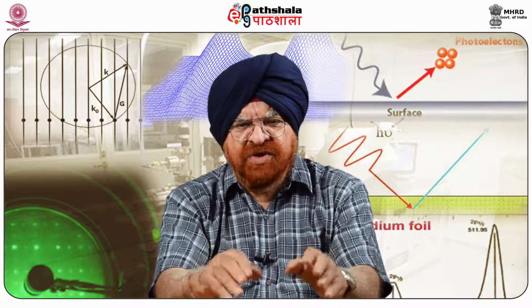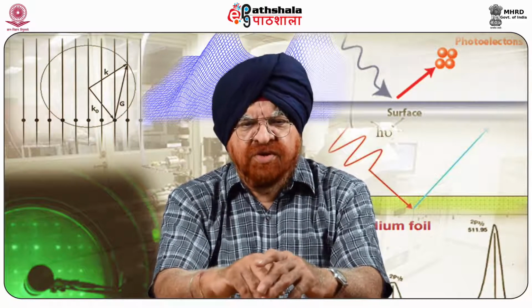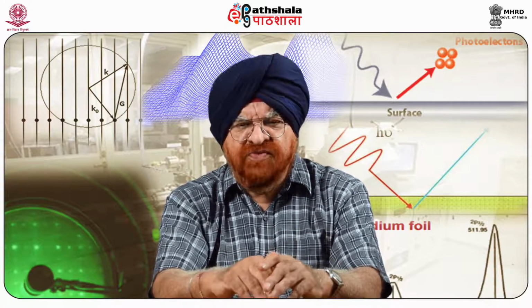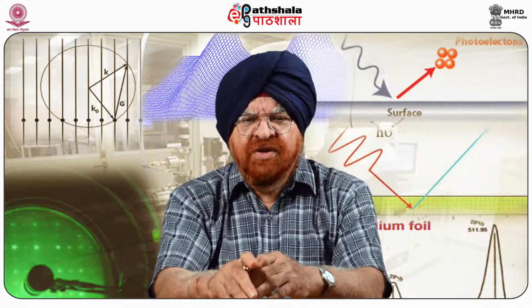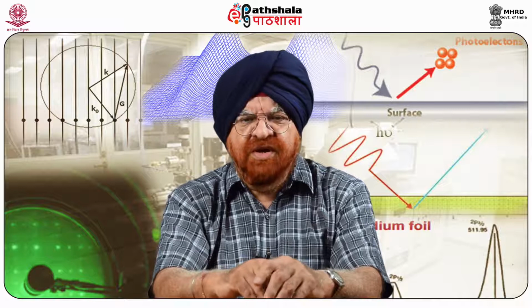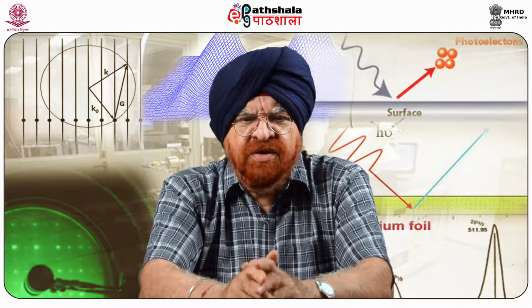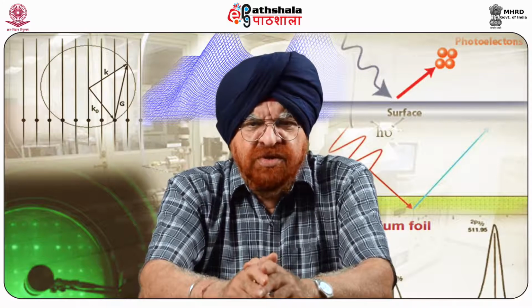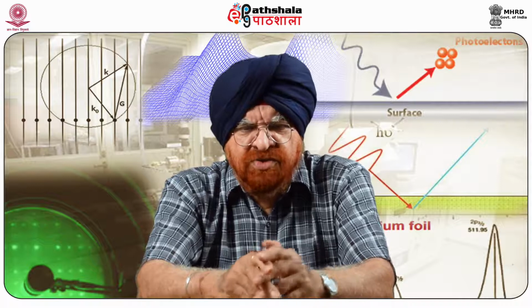This can be done, for example, with diazonium salts, simple alkyls, hydrogen ions, or ozone and oxygen interfaces, and amines, of course. Multi-wall nanotubes are typically used for their rigidity. Because of their approximately planar ends, one can estimate the number of functional groups in contact with the substrate, knowing tube diameter and the number of walls, which helps in determining single moiety tensile properties.